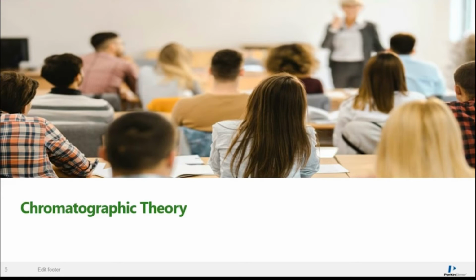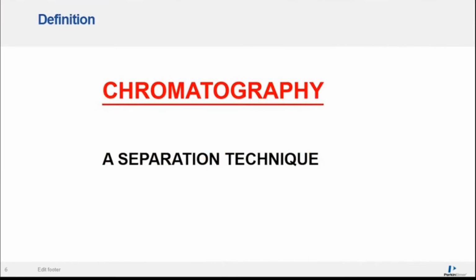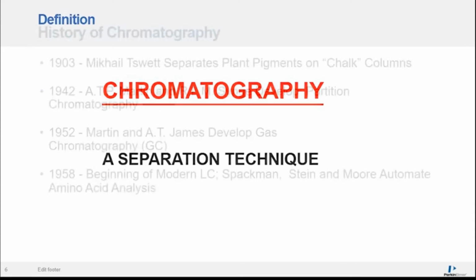What exactly is chromatography? It is a separation technique. It is a technique that allows us to take a sample or a mixture and determine each of the individual components that make it up.